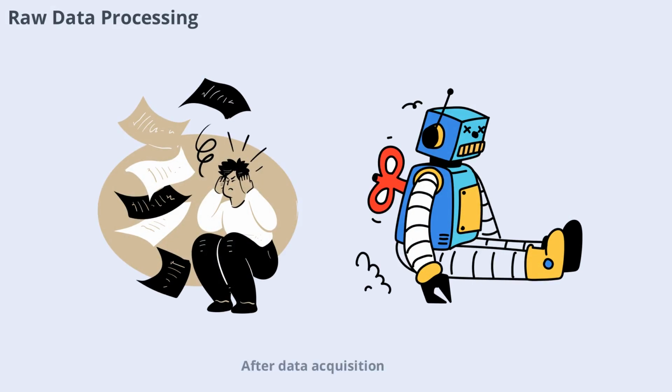After data acquisition, raw mass spectrometry data must be processed before analysis. This involves converting instrument files into standardized formats, filtering noise, and extracting relevant features. Specialized software tools automate these steps, ensuring consistency and accuracy. Proper data processing is vital for downstream analysis, as it affects the quality and reliability of the results. By following best practices, researchers can maximize the value of their proteomics data.